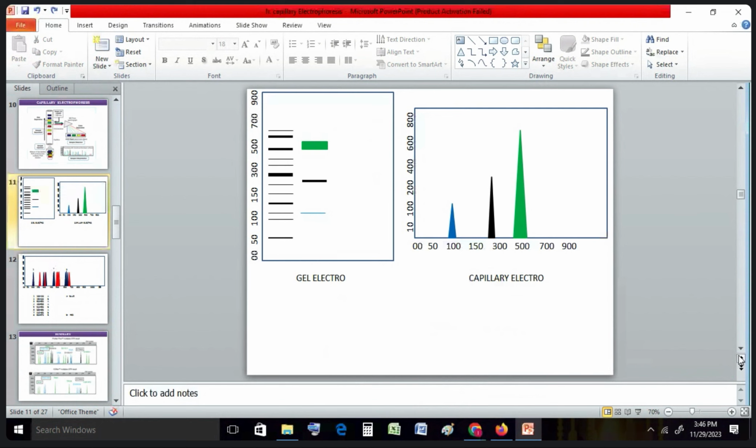That means a locus which is heterozygous, and the repeat numbers are 15 and 20. So for 15 and for 20, you are going to have two different amplified products.